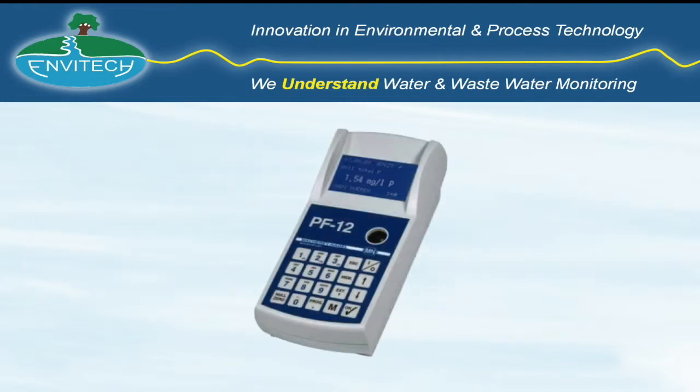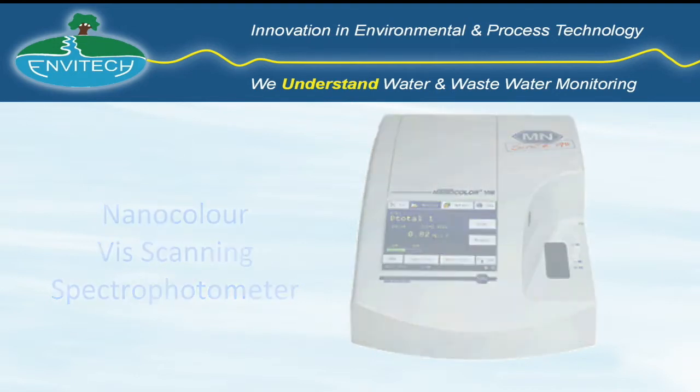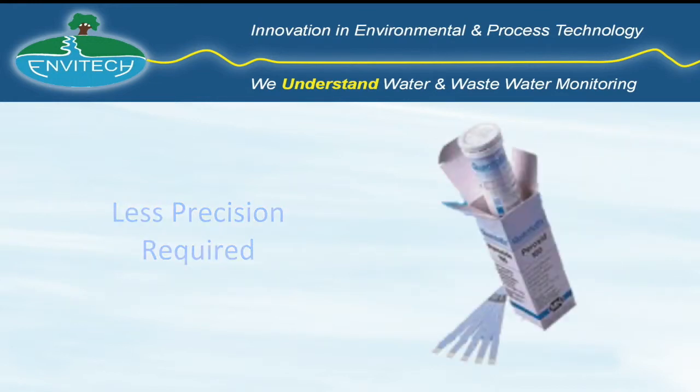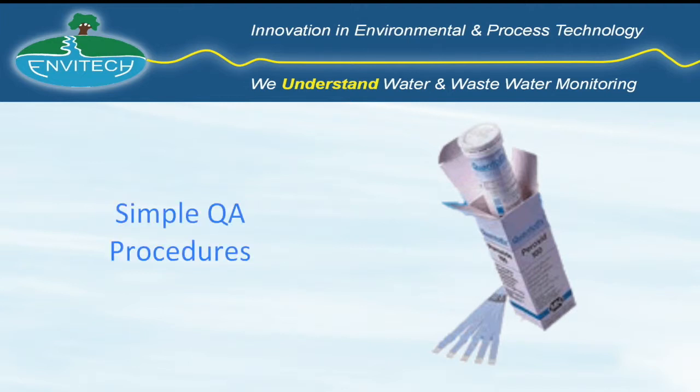The PF12 is the simplest and lowest cost of the Macri & Argel photometer and spectrophotometer family of instruments, namely the PF12, the Nanocolor Vis scanning spectrophotometer, and the Nanocolor UV Vis scanning spectrophotometer. Where less precision is required at lower cost, the Quantofix range of test papers offer an easy to use system ideal for simple QA procedures.